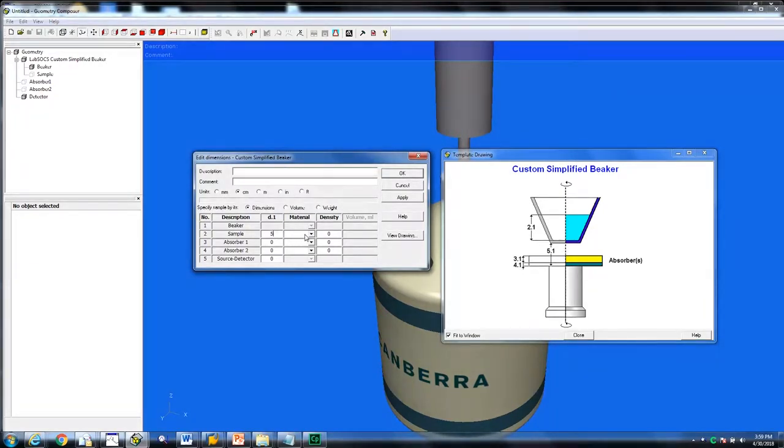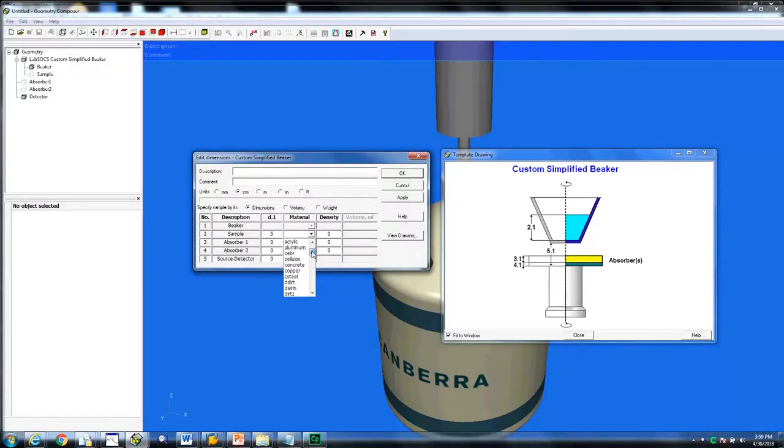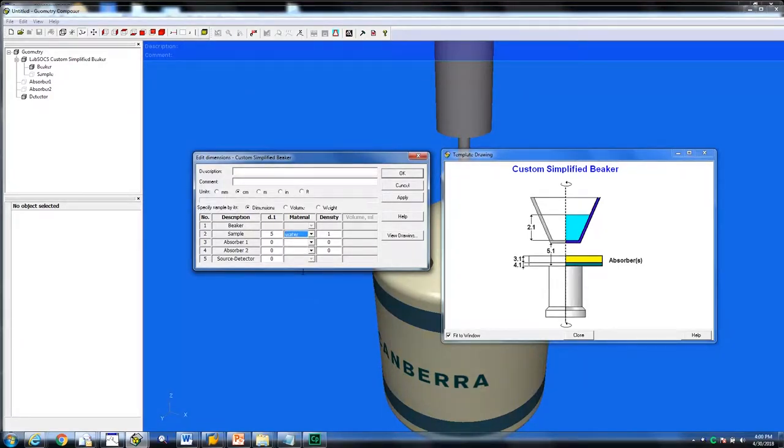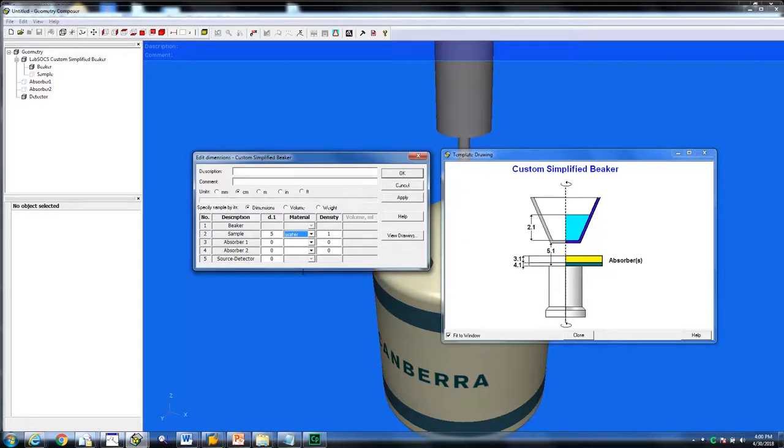Select from the material drop-down list the type of material the sample is. We have chosen water. It will automatically fill in the density of 1 gram per cc. For other matrix materials, it is important to enter a specific density value that matches the density of your sample and not simply use the default density.